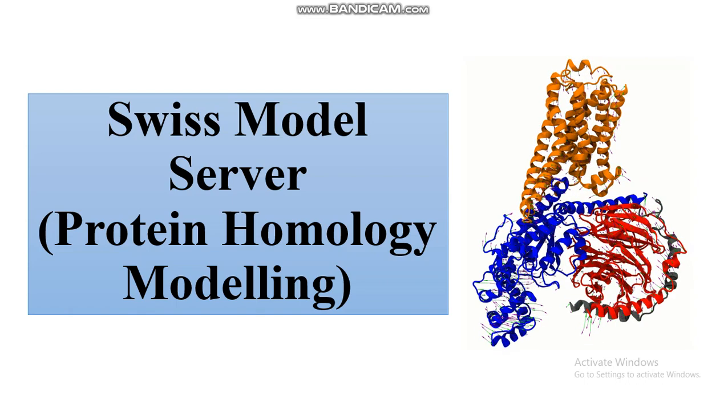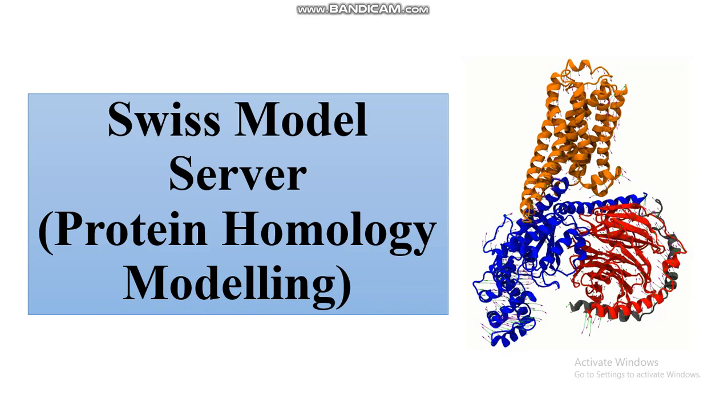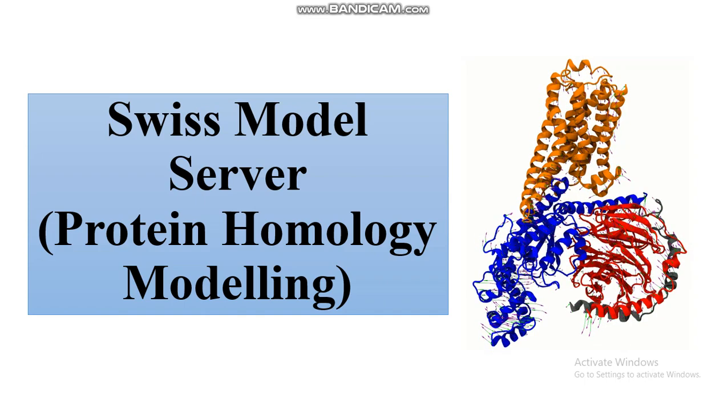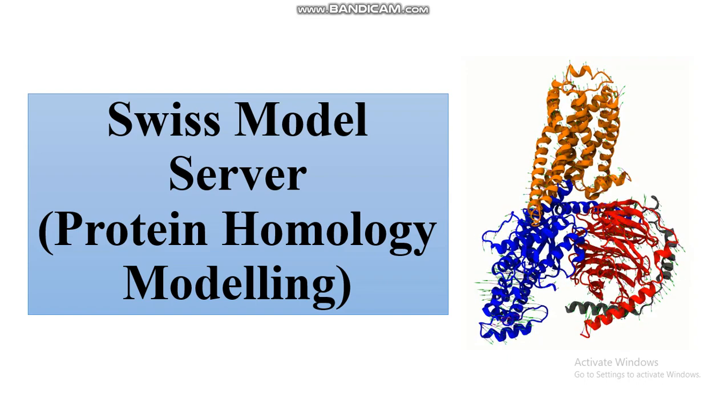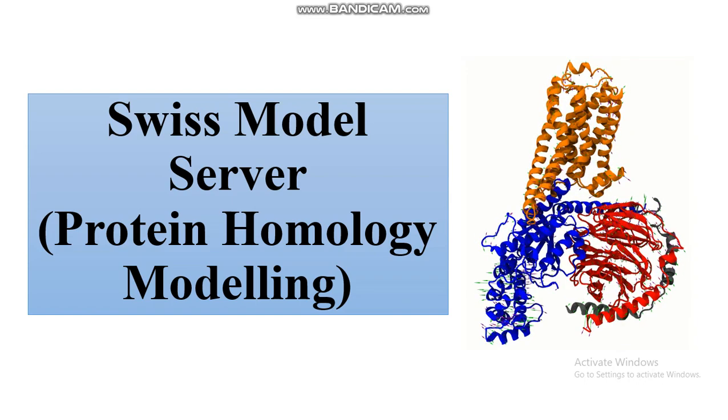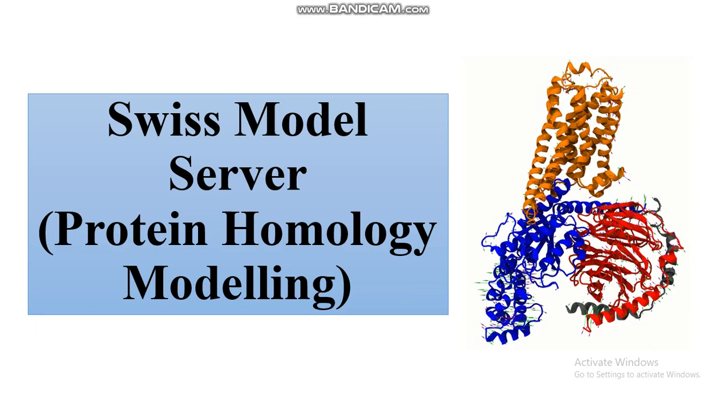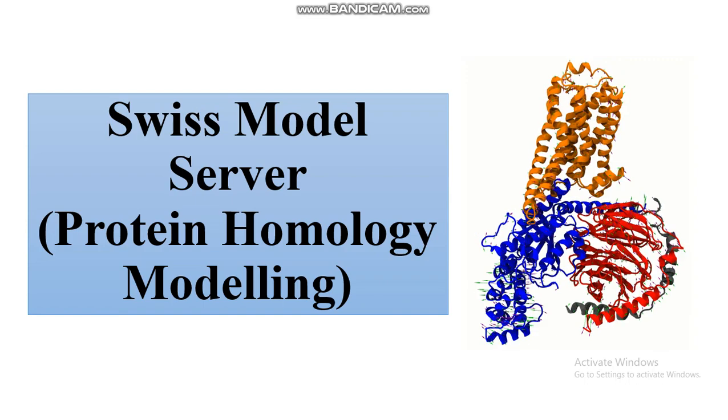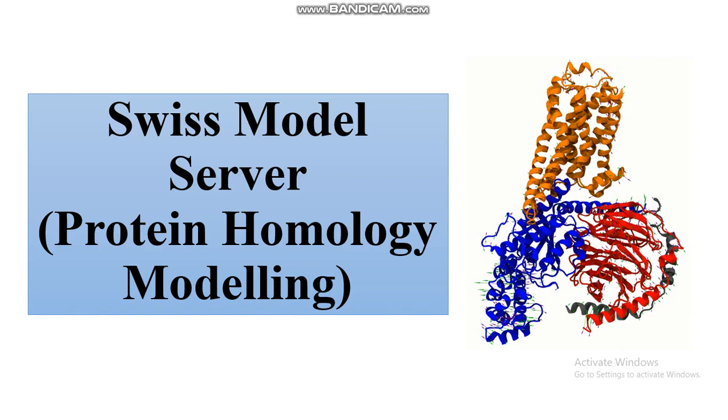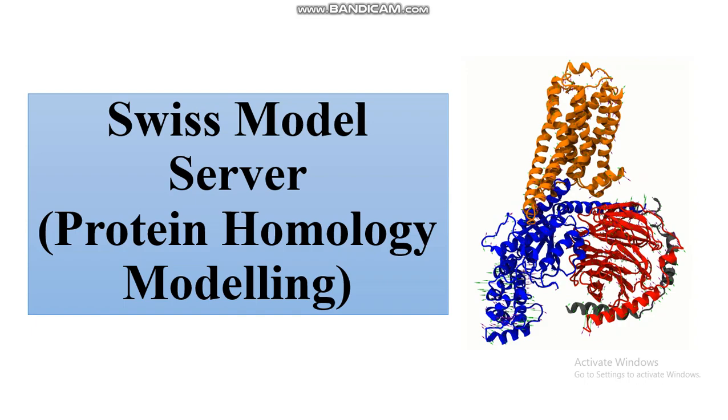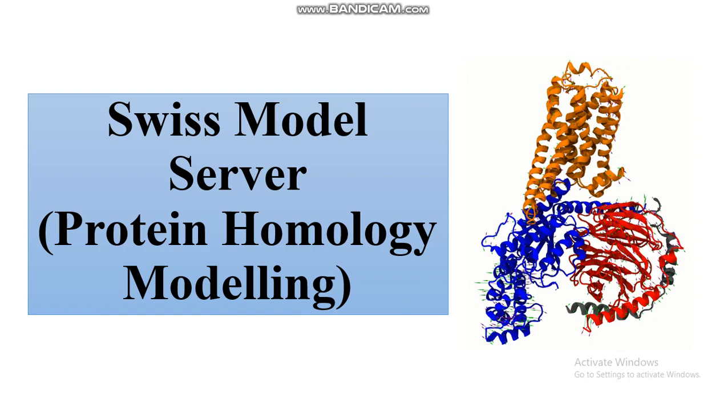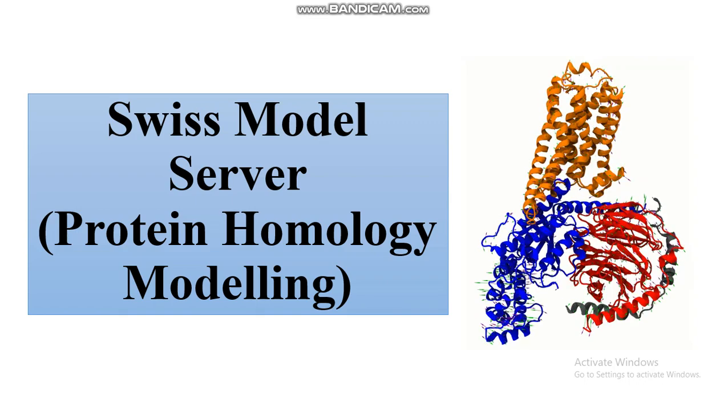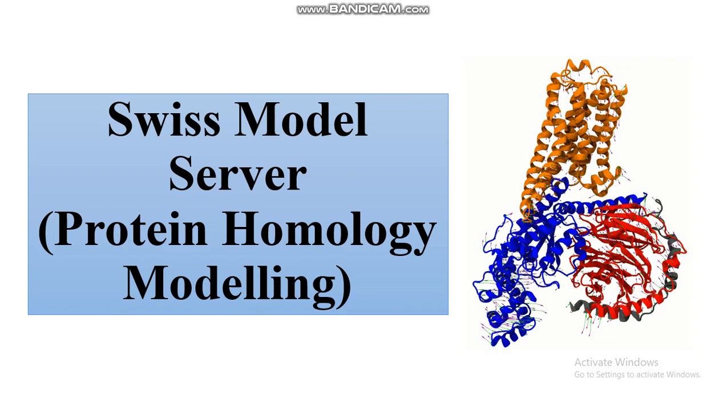For docking studies, if the 3D structure extracted from RCSB PDB database has a higher resolution, this structure may have some interaction changes in molecular docking study. For this, we have to choose the 3D structure based on its resolution. If you have issues regarding the higher resolution of 3D structure, you can remodel your 3D structure using this Swiss Model Server.